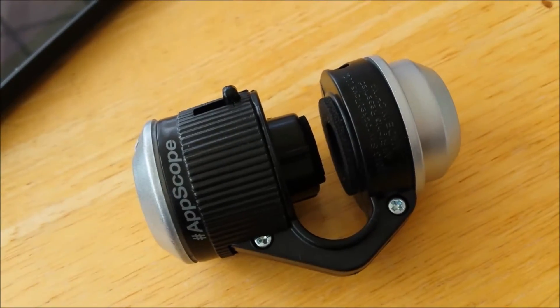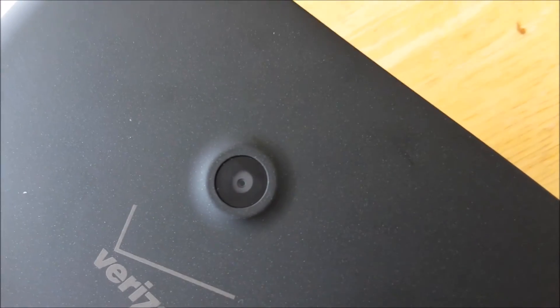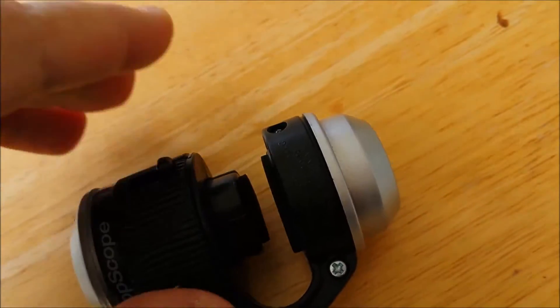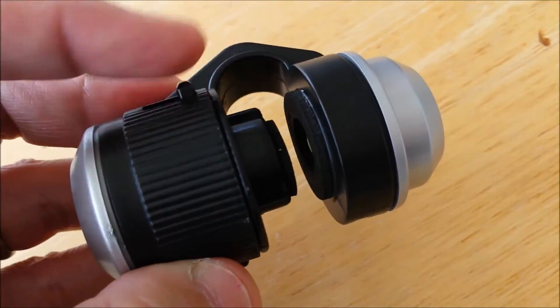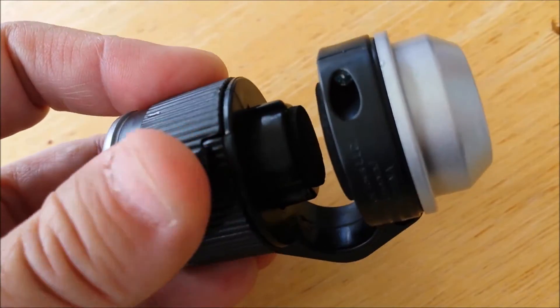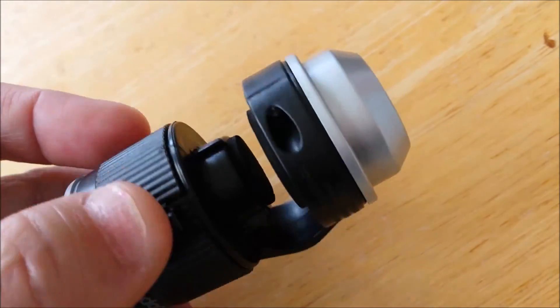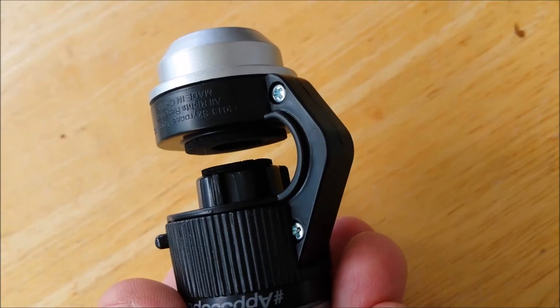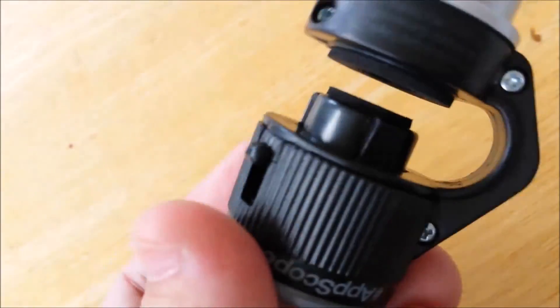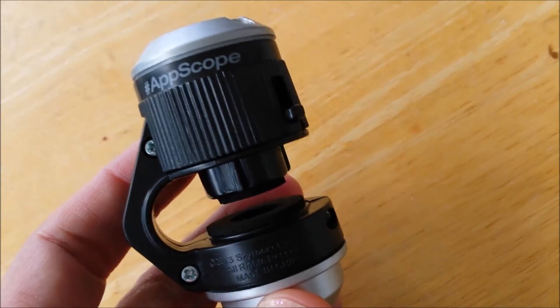Okay that's our test with the Samsung S4. So far tons of fun. They're going to be the end of the fun because on my tablet the camera is pretty far away from the edge, so this device is pretty much set up for a cell phone or a device that has a camera on the edge of it. There's no portion that you turn or anything — the focus truly depends on your own camera's auto focus and it just enhances your auto zoom. But I would give this inexpensive device an A+. I can imagine it would be a great Christmas gift and would keep the kids occupied probably for a long time. I hope this is helpful.